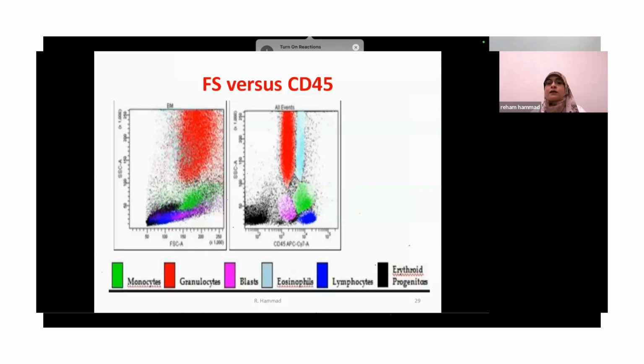They are so much amalgamated that you cannot separate the leukocyte from the debris, and you cannot separate the monocyte or even the blast sometimes, when they are found, and the neutrophils are lying on the white area, or sometimes even entangled with the dendritic cell.